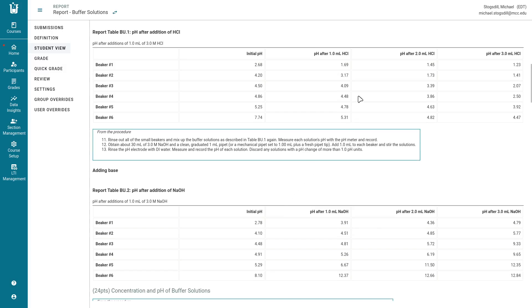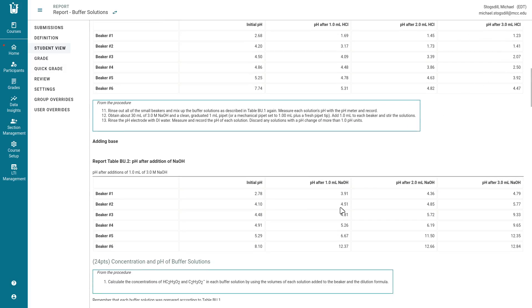After that we have the pH after the addition of 1 mil of acid, 2 mils of acid, 3 mils of acid, and then 1 mil of base, 2 mils of base, 3 mils of base. We're going to use these to determine the buffering capacity of these various solutions.